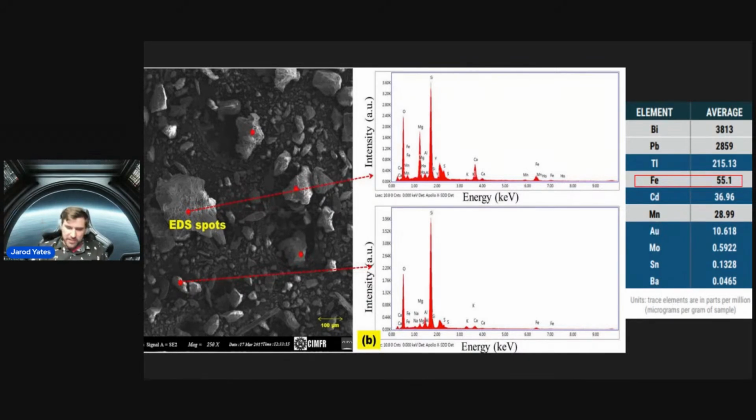So something to consider. The fact that we never found any iron in ours suggests that there's less than 1% of iron, kind of like what maybe they're saying. Compared to slag, you would see much higher amounts of iron. So really important to consider when you're talking about the slag angle, where the heck is the iron?